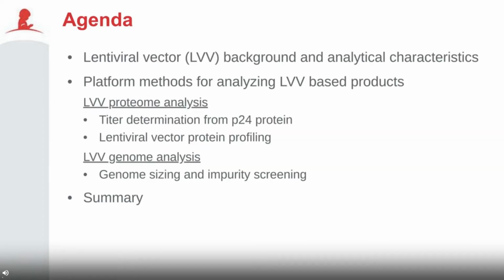All right, so with the background taken care of, let's talk about the agenda for today's talk. First, we're going to go into a little bit about what a lentivirus looks like. What are the platform methods that we're going to look at today that will allow us to analyze these lentivirus products, which includes the lentivirus proteome analysis.